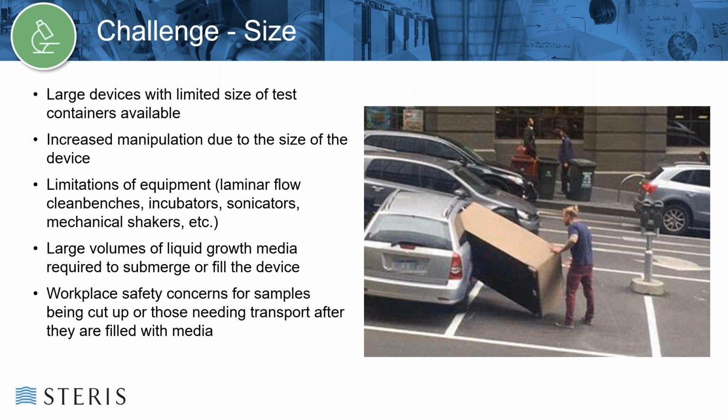Limitations also exist with equipment. Laminar flow clean benches have specific sizes, up to about 8 feet in length, and specific depths as well. Incubators can be a limiting factor if we're filling large bioprocessing bags that are meant to hold, say, 500 liters of growth media for a cell and gene therapy product or pharmaceutical product.